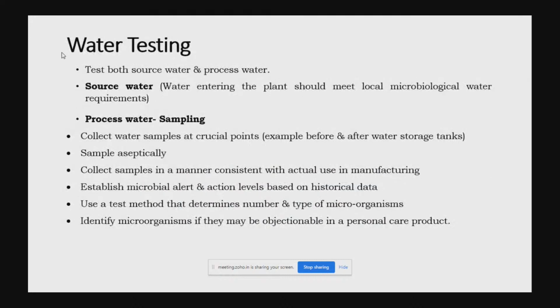After that, in the pharmaceutical industry, we analyze materials and everything, but there are two most important things being utilized: water and EM. Here I will briefly cover water, how the pharmaceutical industrial water system works, and how microbiologists monitor those water systems.